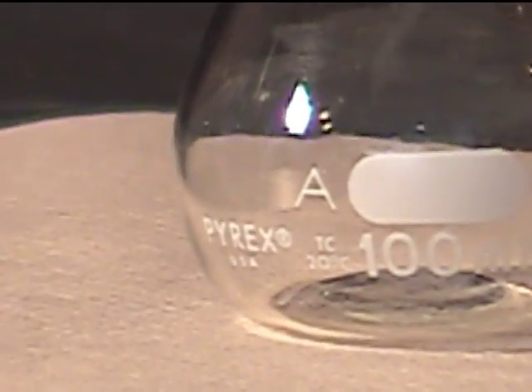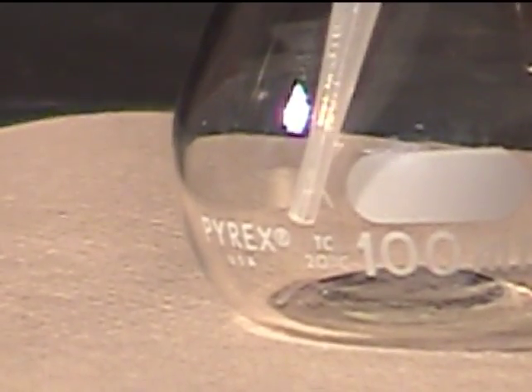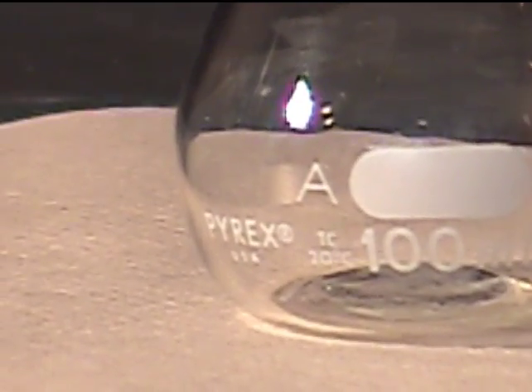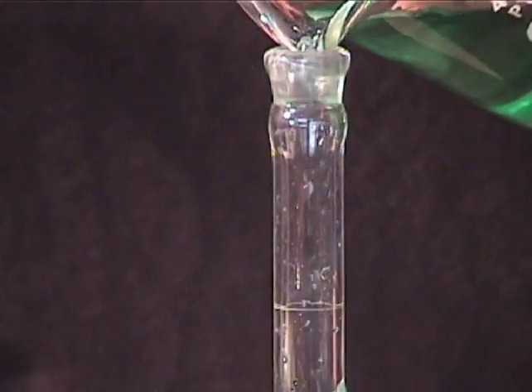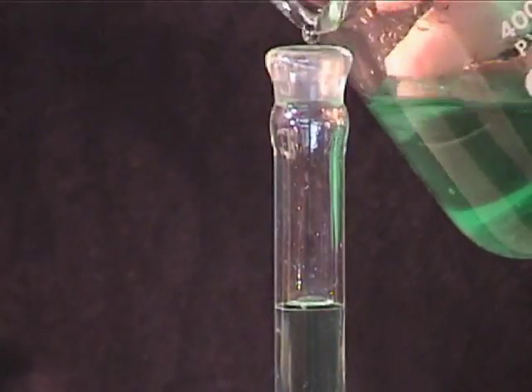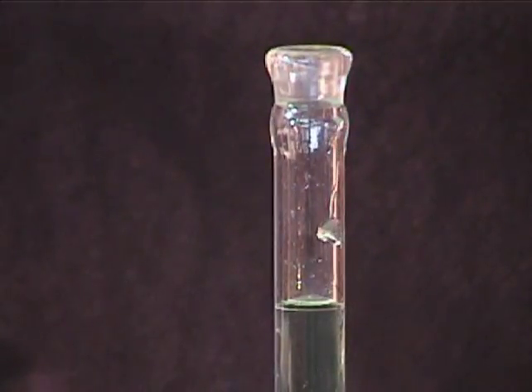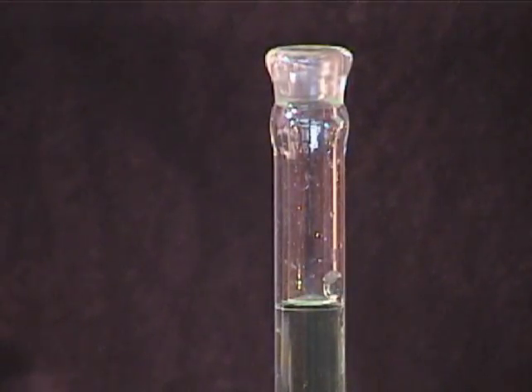This indicates that the flask, when filled to its mark, will contain a certain volume of liquid. When filling the volumetric flask, never pour the sample directly down the neck of the flask. The reason for this is that a drop clinging to the neck of the flask may roll into the solution after the flask has been brought to the proper volume, introducing error.